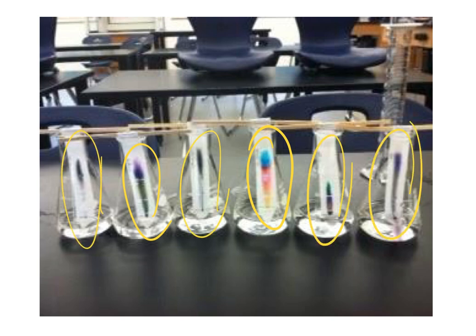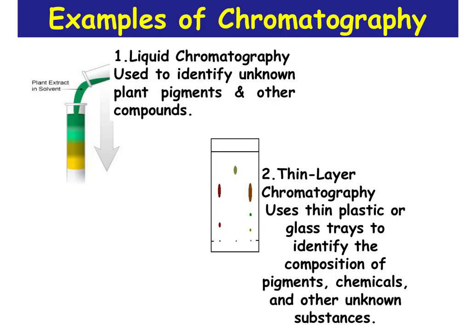We are actually using these exact same ones, and you can see even though they're all black ink, they will separate out into different pigments based on the brand of ink it is. So some different examples you will see being used.